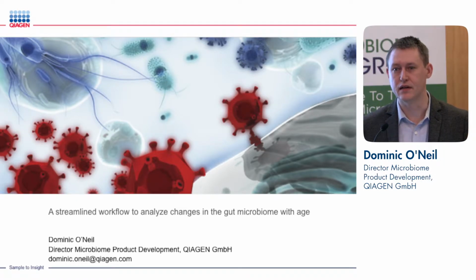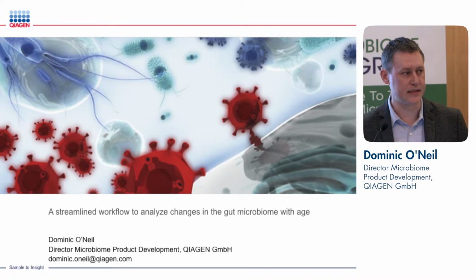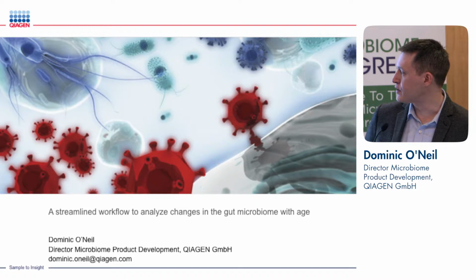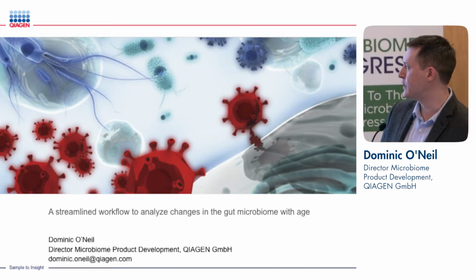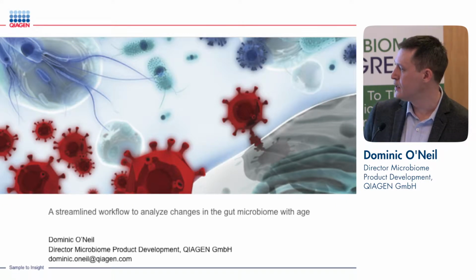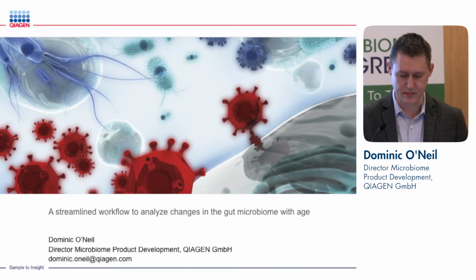I'm the Director of Microbiome Product Development at Qiagen on the life science side of the business, so I'm responsible for sample extraction business. I'll be giving a talk here on a streamlined workflow to analyze changes in the gut microbiome with age. So as I said, I'm going to be presenting on a workflow that we set up to analyze changes in the gut microbiome with age.